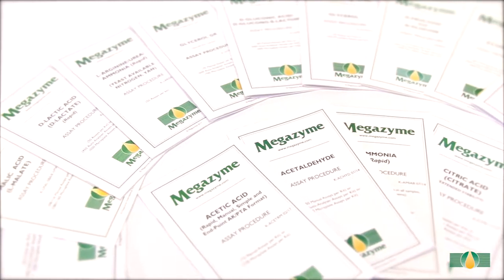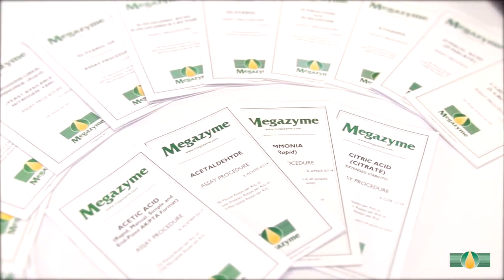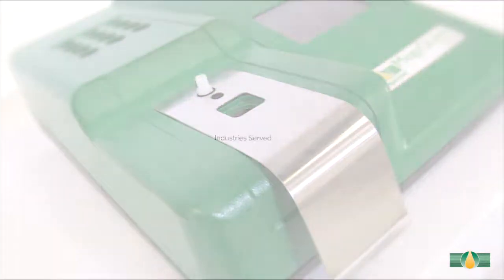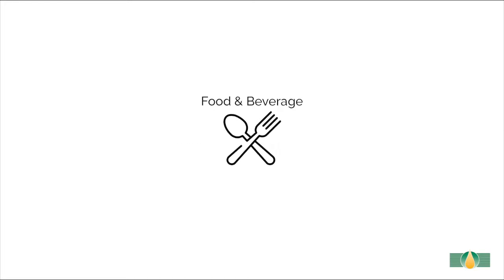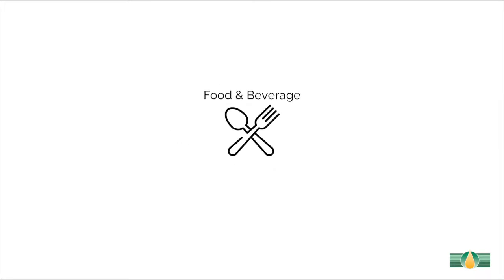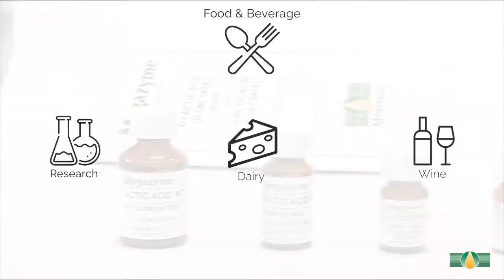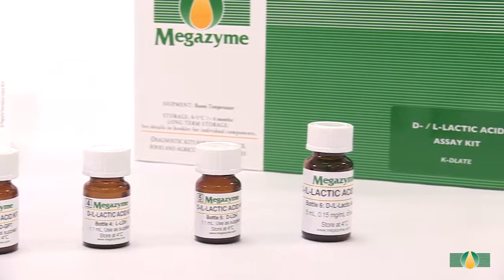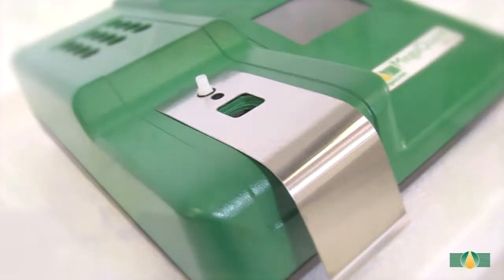Megazyme provides an extensive range of assay kits for use in various assay formats, including autoanalyzer, microplate, and manual spectrophotometer. This D-L-lactic acid assay kit can be used to accurately measure D or L-lactic acid in various sample types throughout industries such as food, dairy, and beverages. This video tutorial will demonstrate the use of the assay kit with a wine sample using the manual spectrophotometer format.